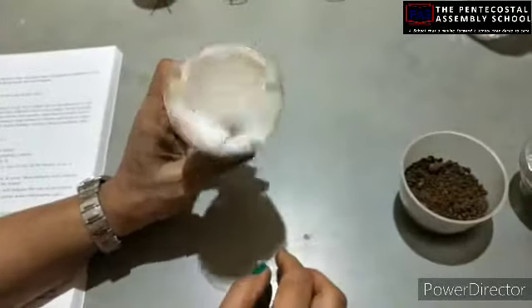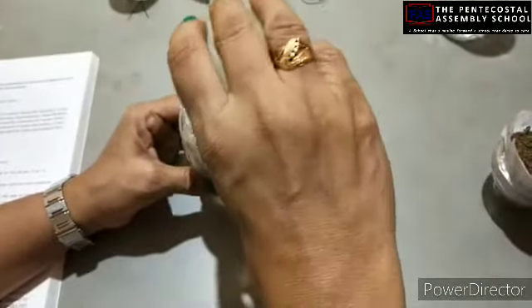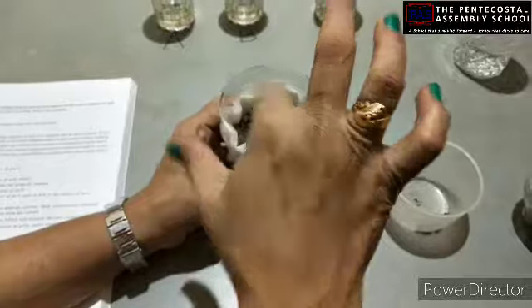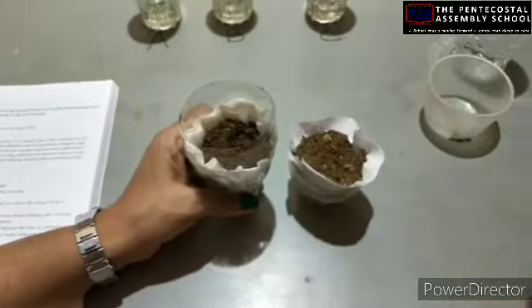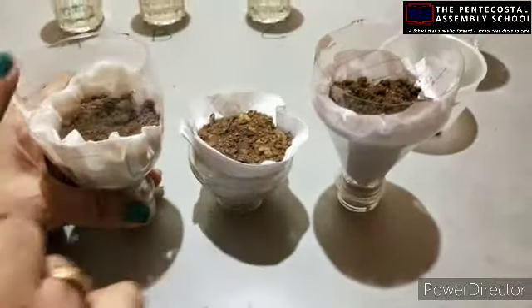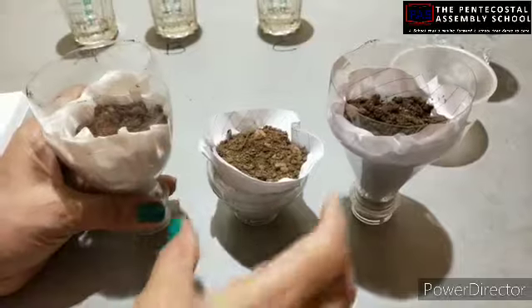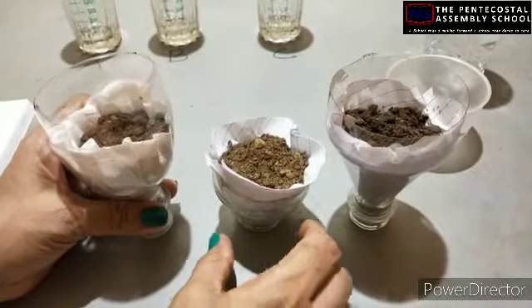Okay, is this clear? Now we can put the soil sample in it. In this way we have to take 3 funnels with the 3 soil samples. In the same manner, you can put paper or napkin paper to just cover the opening of the funnel.